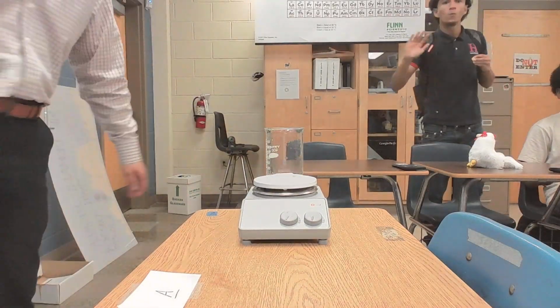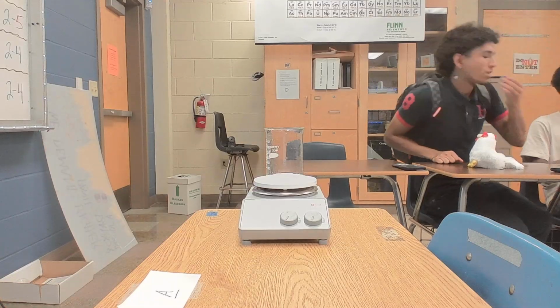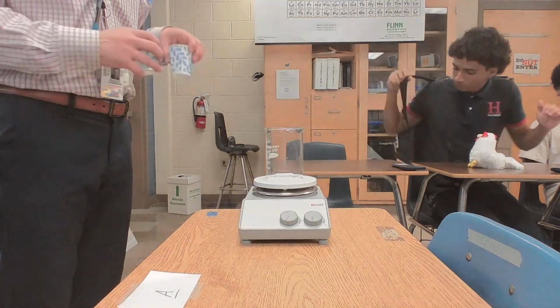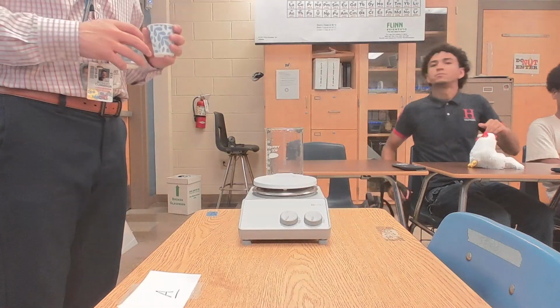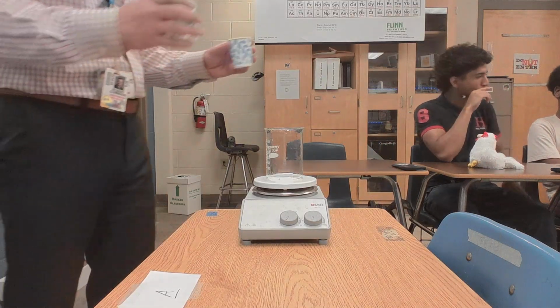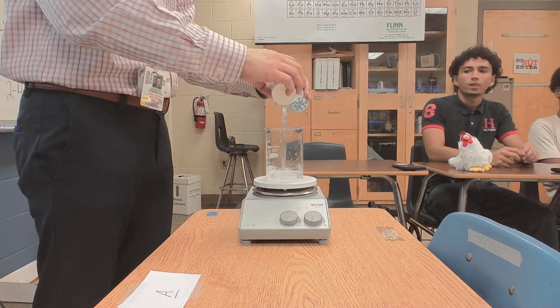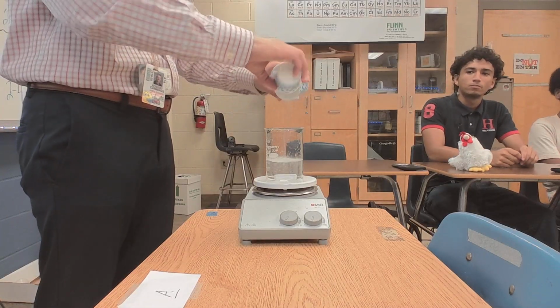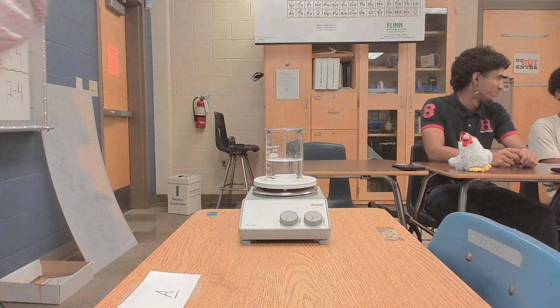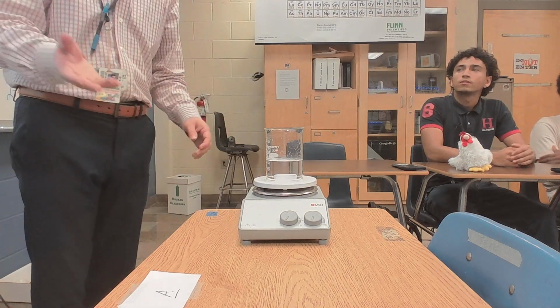So we're at the very beginning of kinetics. Let's start off with a little reaction here. I've got a couple different chemicals that I'm gonna dump. They're both clear. So as I dump the clear into the clear, they're still clear. What's interesting about the start of this is that it's a no reaction.